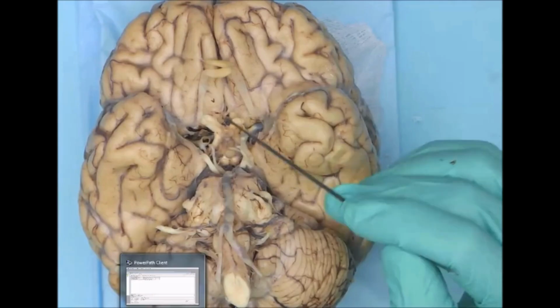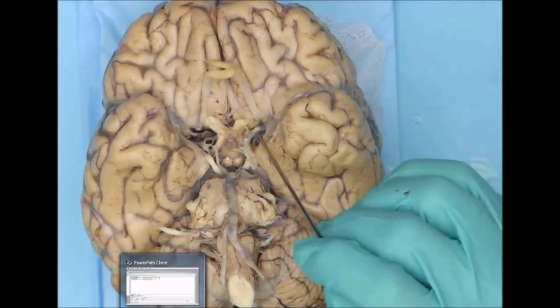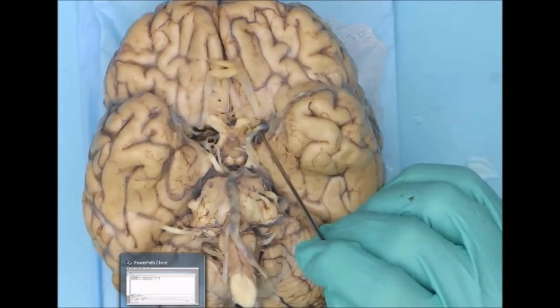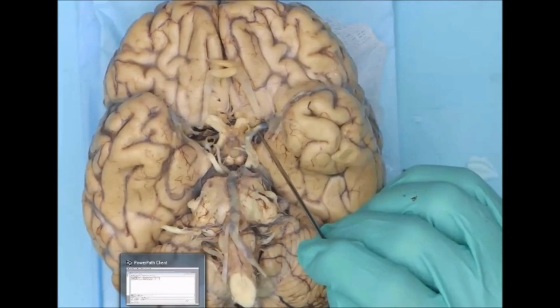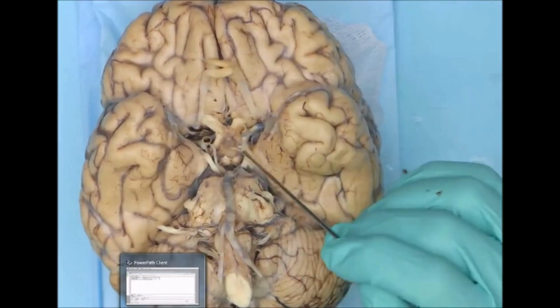So now I'm going to continue to dissect out the circle of Willis. If you look right here, there's a little bit of discoloration, which is maybe a little bit of early atherosclerosis. So I'll come back in a minute with this dissected out and we'll continue.